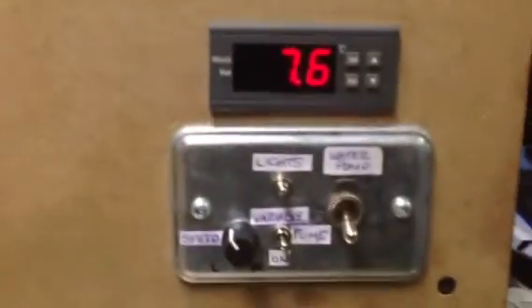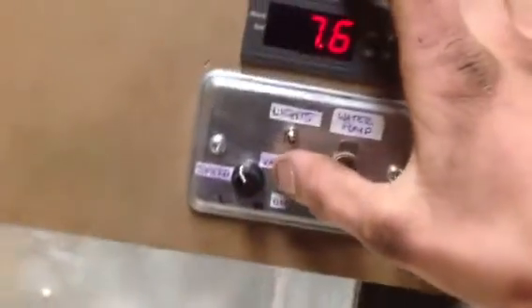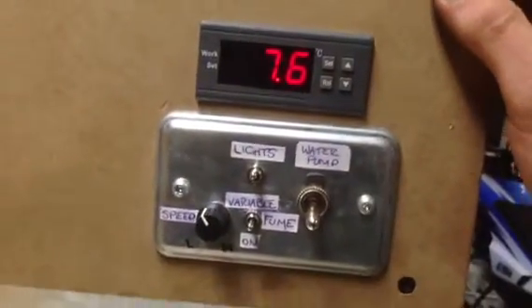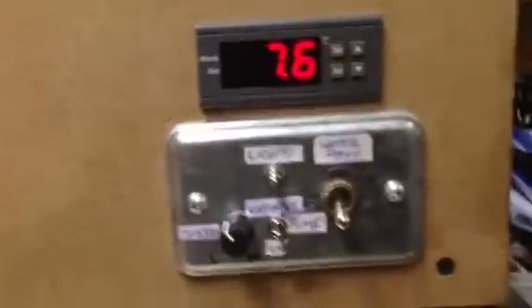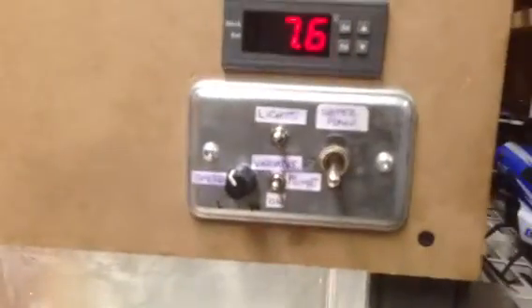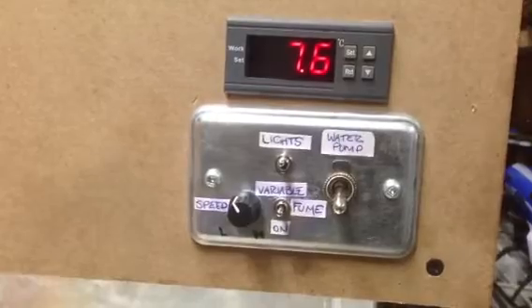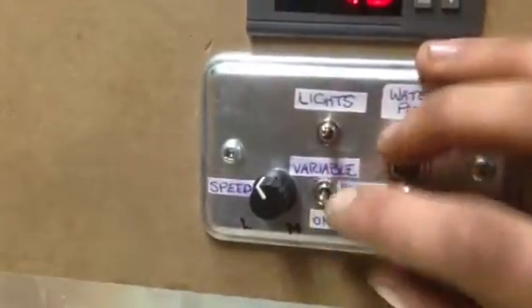When I ordered the fume hood, it came with a variable speed controller in a box — that would plug into the box and the box would plug into the wall. That was unacceptable for me; I wanted it all on this faceplate here. If you have any experience in electronics and you pull that box apart, it's pretty straightforward. There's a triac mounted to the back metal plate as a heat sink — just unscrew that. Cut the box apart and there's a three-way switch, which I've replaced with my own three-way switch so it looks nice.